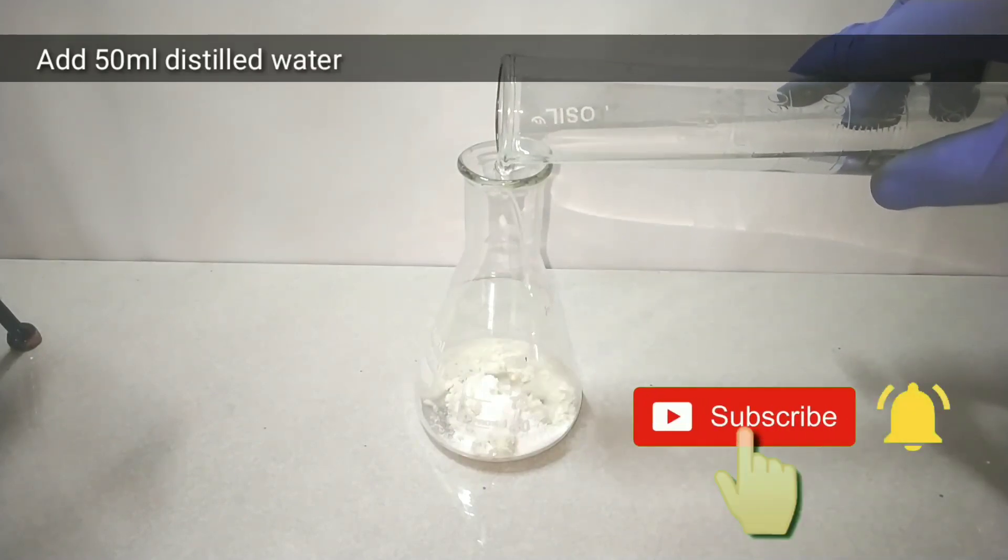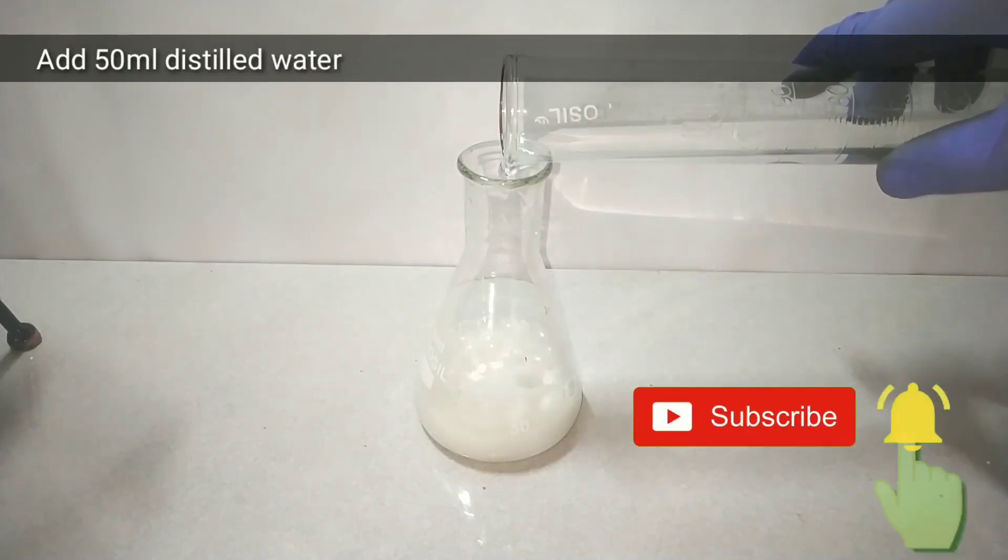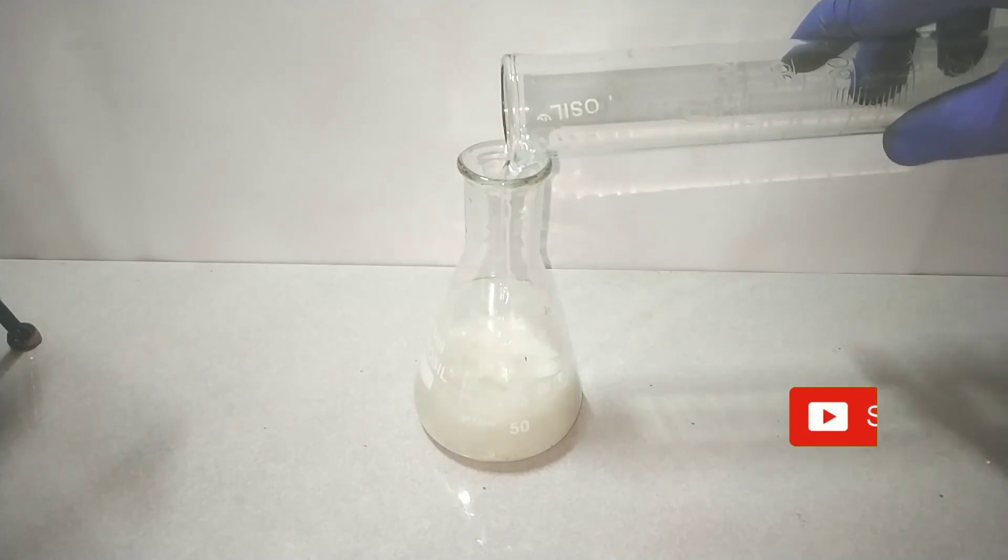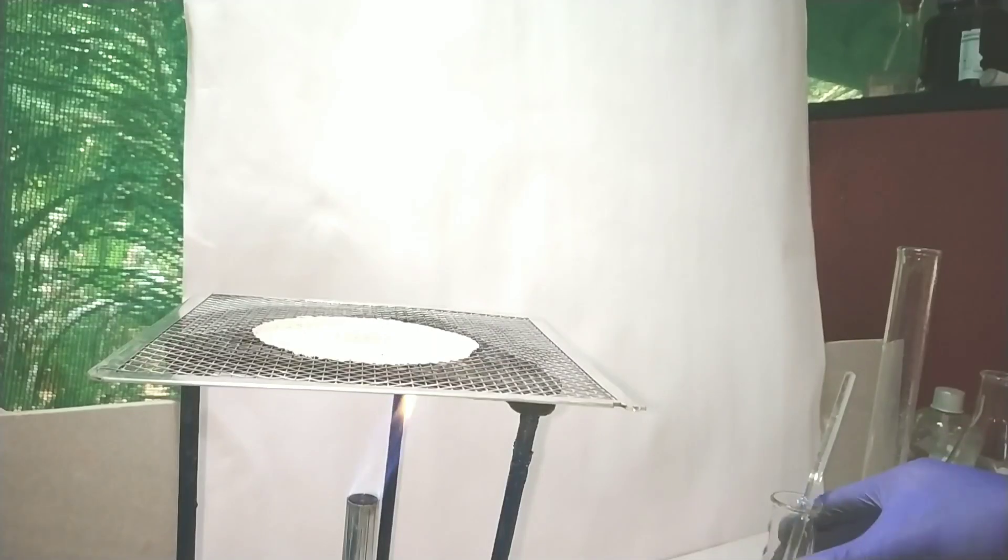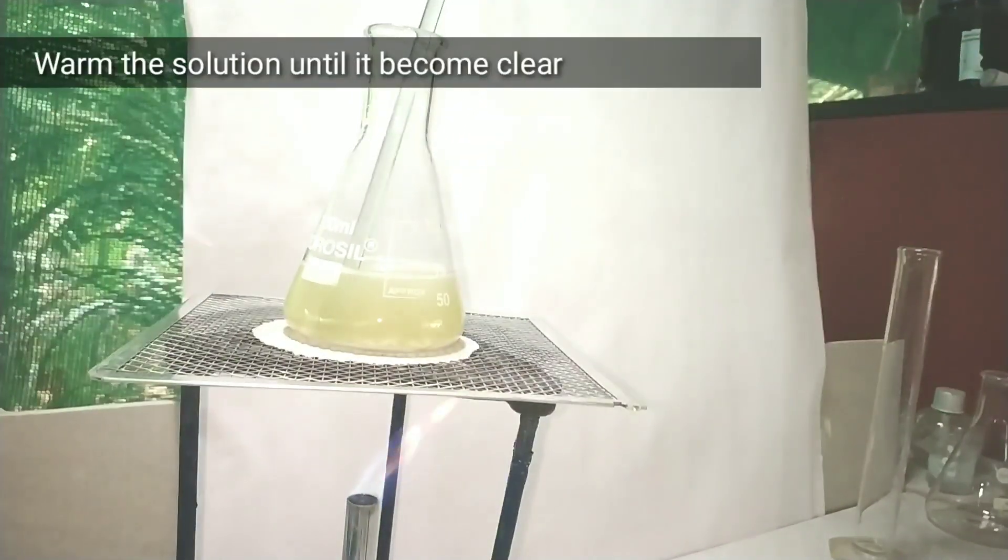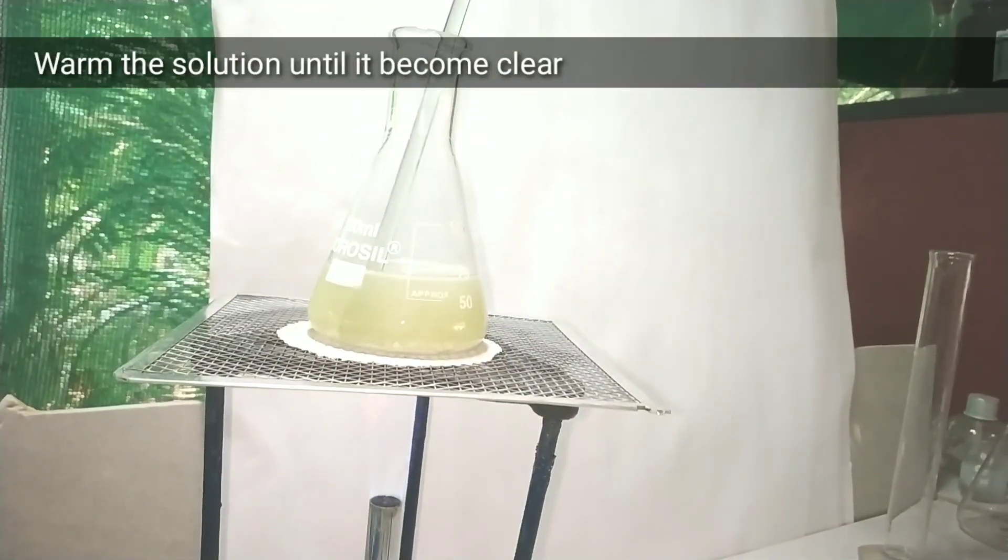Into that we add 50 ml of distilled water to start the reaction. Sulfanilic acid, being an acid, starts reaction with the carbonate giving out carbon dioxide which you can see as the effervescence. It forms sodium salt of para-amino benzene sulfonic acid.